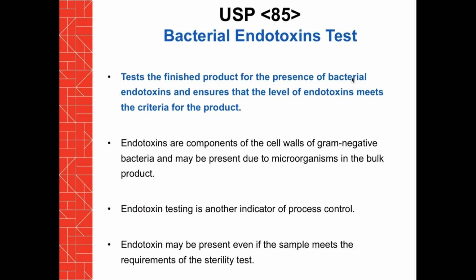When a product is administered as a parenteral, a patient can receive up to 5 EUs per kilogram of body weight, and as an intrathecal, only up to 0.2 EU per kilogram of body weight. It's important to know that, in order to determine the endotoxin limits of a particular drug product and a particular patient, this limit must be calculated into the maximum dosage of the product that will be administered as well as the patient's weight. Thus, the need to have that information to calculate the limits.